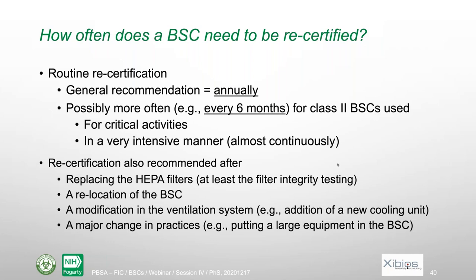Also, remember that recertification is also recommended after replacing HEPA filters, to be sure that they are still okay and the gaskets are okay. After changing the position of a biosafety cabinet, after modifying the ventilation system, or after, for instance, putting a large equipment in the biosafety cabinet.